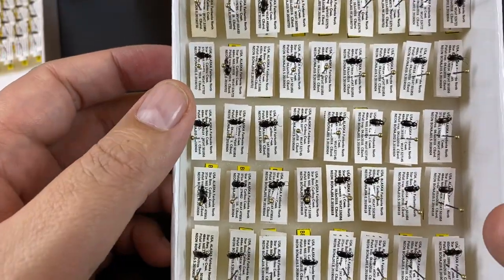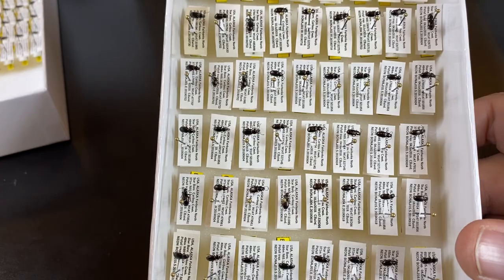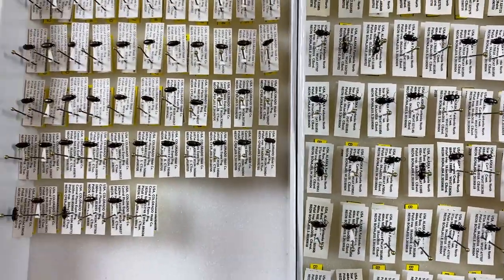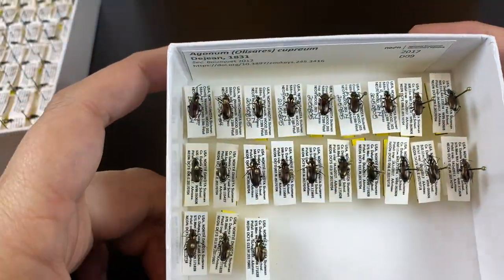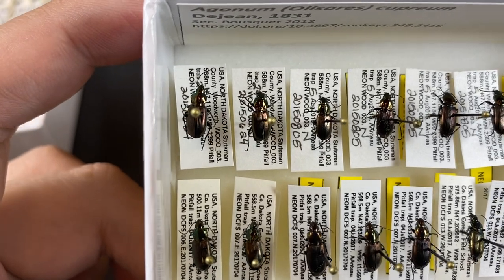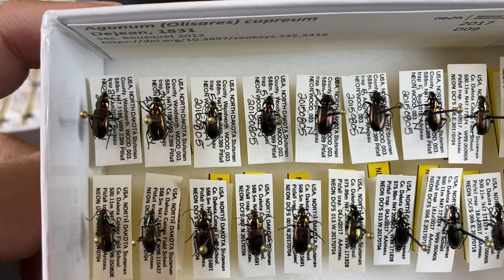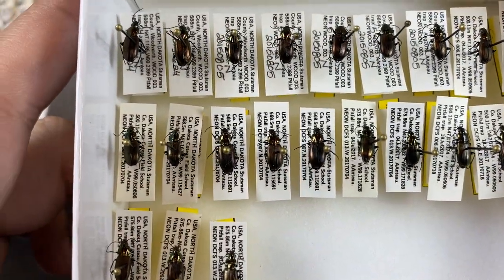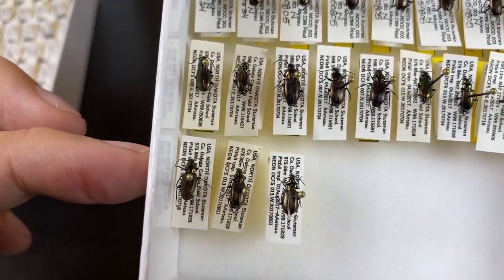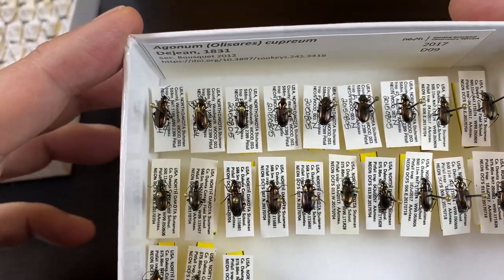We also want to think about practicality. Larger labels are going to take more time to cut down. There are steps we can take in printing labels so there's less physical cutting required. Looking at these Agonum specimens, the top labels are a bit larger because there was some handwritten information on them — which probably saved time — but it results in larger labels than the printed ones below, with extra space that could have been trimmed. That affects how many specimens we can fit in a single unit tray and ultimately how many specimens we can fit in our collection as a whole.